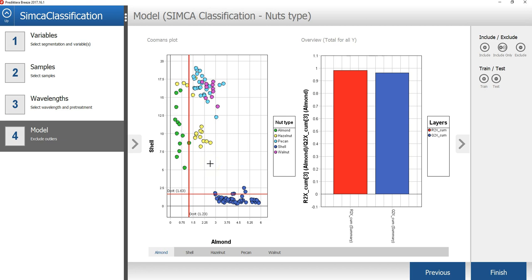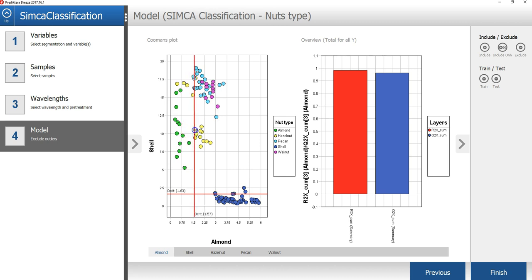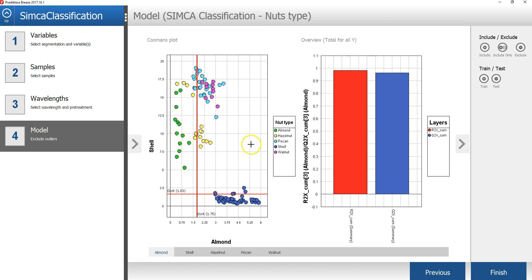In the Koeman's plot, you can set the critical distance for each class model by dragging the red vertical line to adjust the limit to include all objects for that class. Samples to the left of the red line are included, and samples to the right of the red line are excluded. In this case, all almond samples are included in the almond model.